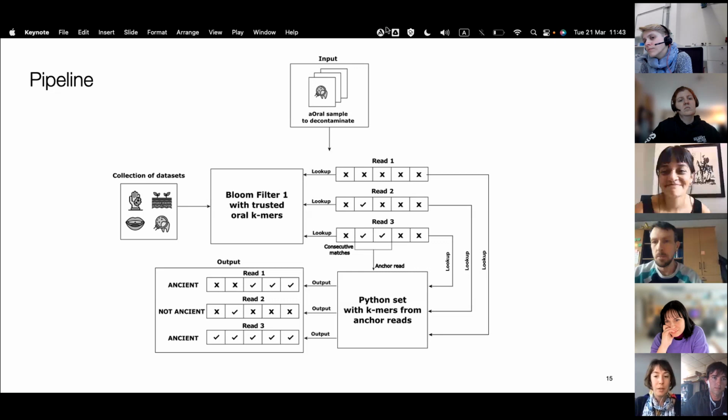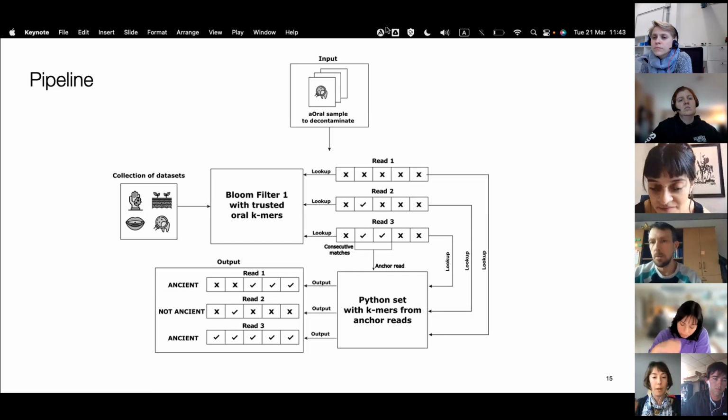Yeah. So, related to that, have you ever done comparisons of the taxonomic profiling tables of your FASTQ files before and after you've done the contaminant removal with akmerBroom, and seen whether or not it actually does reduce the amount of contamination that you pick up?